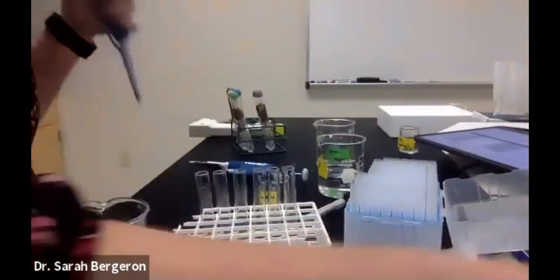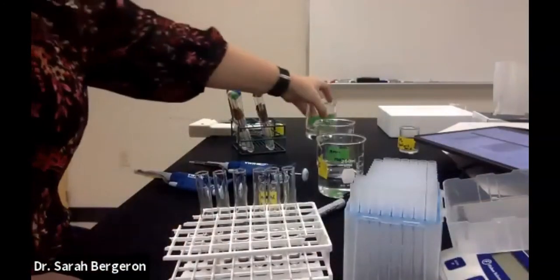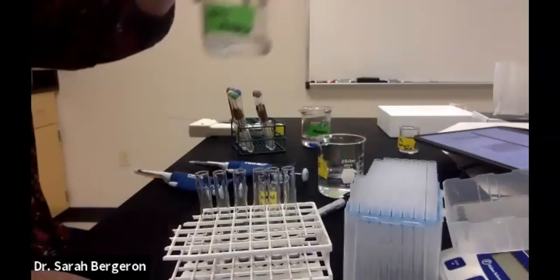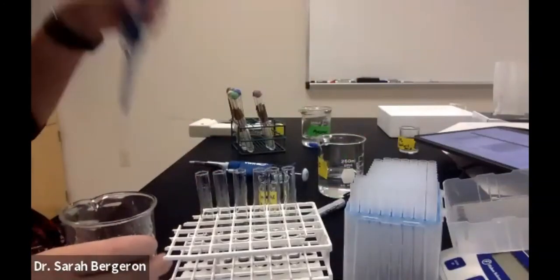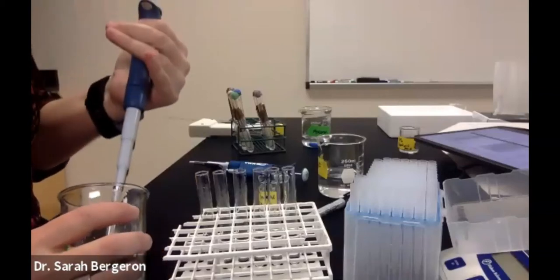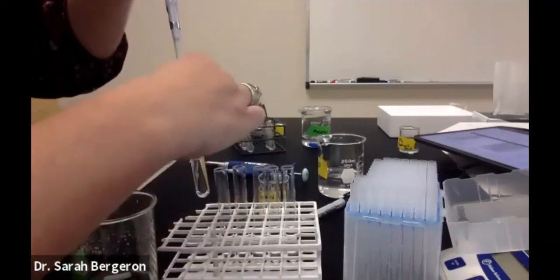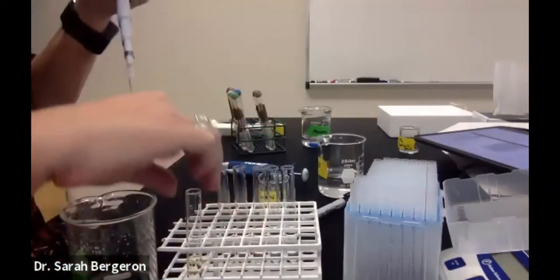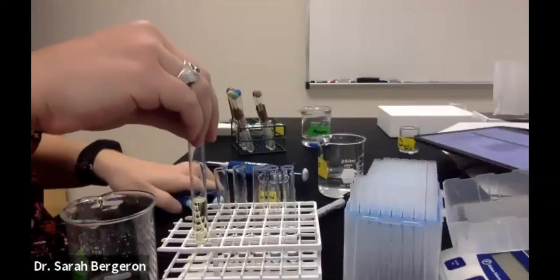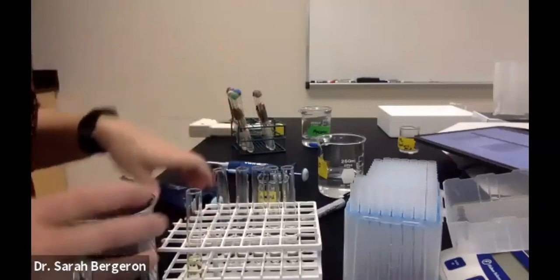All right, and then after my ascorbic acid, I need ammonium molybdate. So my ammonium molybdate, and I need 0.5 mils of that one as well. So I just like to take them out and move them. Do you see how that one turned kind of yellow, right? This is why it's really important to have a 0 so you can see that difference. Okay.